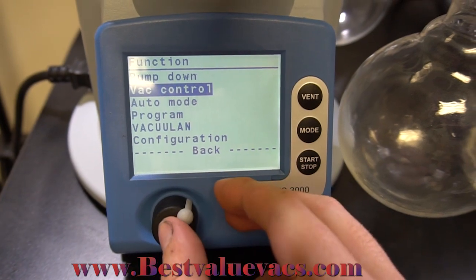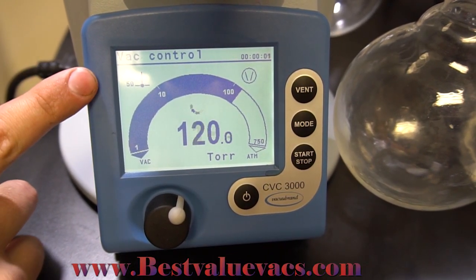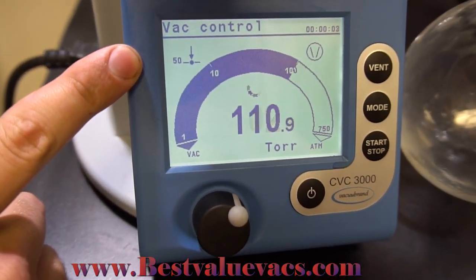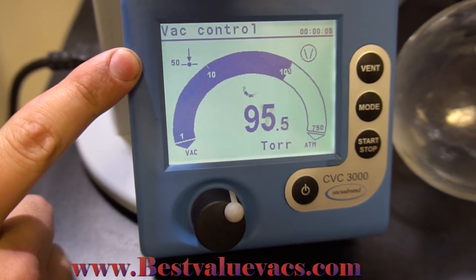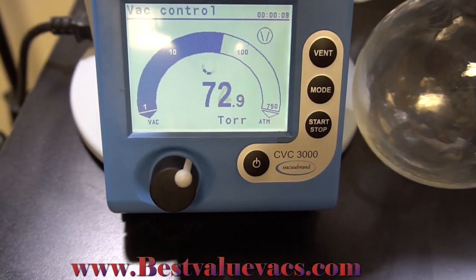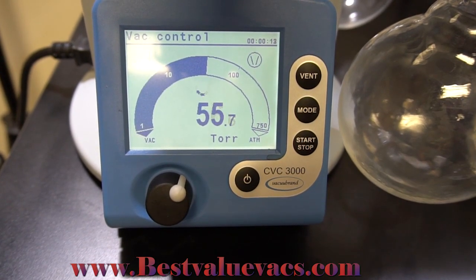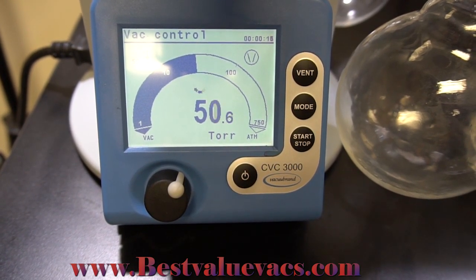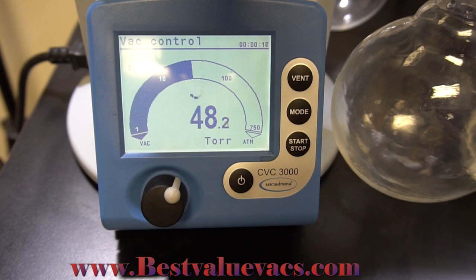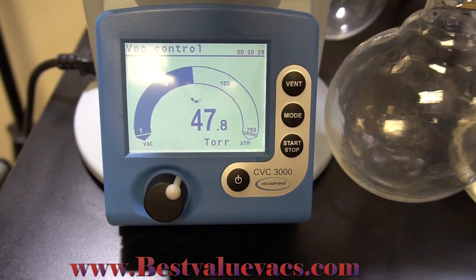We're going to set it to vac control. When I push start, it's going to go down to the predefined level at 50 Torr. You can hear the pump is very quiet while running. As it gets closer to the level, it slows down and turns itself off when it reaches 50 Torr. This is a very energy efficient pump — very quiet and vibration resistant as well.